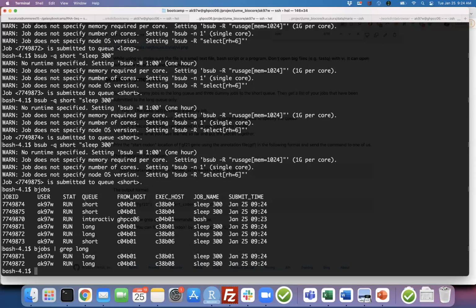And what I did was I just put that wild type sequence, like ACGTAC, whatever, wild type, and then put the FASTQ file, and then did this and divided it by 4. And I showed it like this. You can do it with awk, print $0 divided by 4. I did this and showed that this was the case, and she believed me.